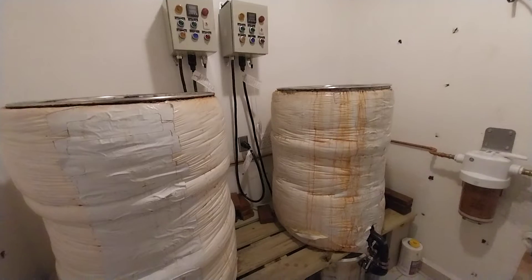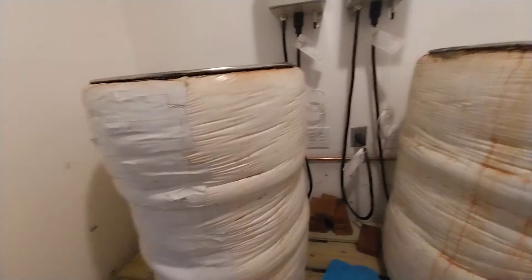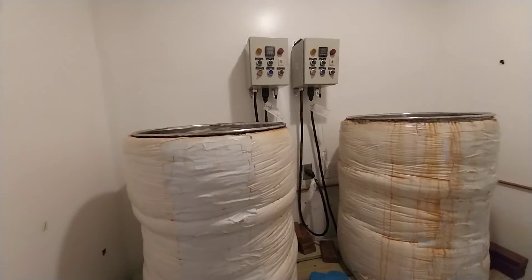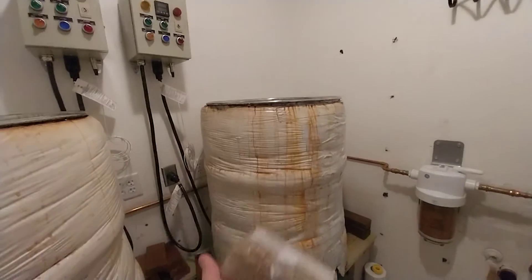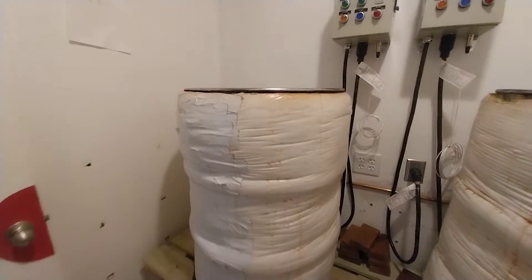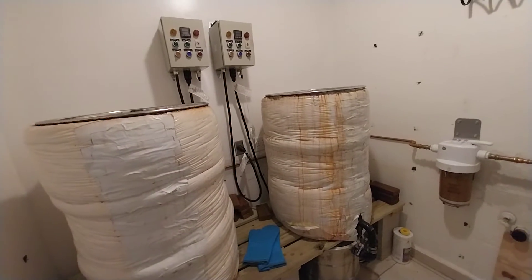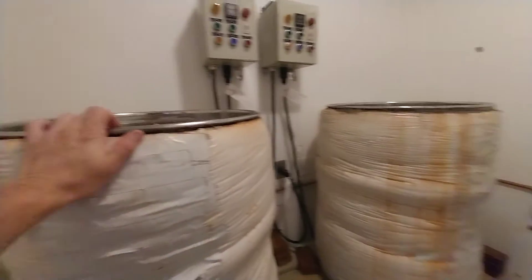When I designed these systems, they weren't exactly designed to be run every single day — mainly because they take a good 14 to 20 hours, depending on the size of the substrate you put in there. These are still hot. The real issue is that they're vertical and not horizontal, and loading and unloading them is actually much more difficult with vertical machines.